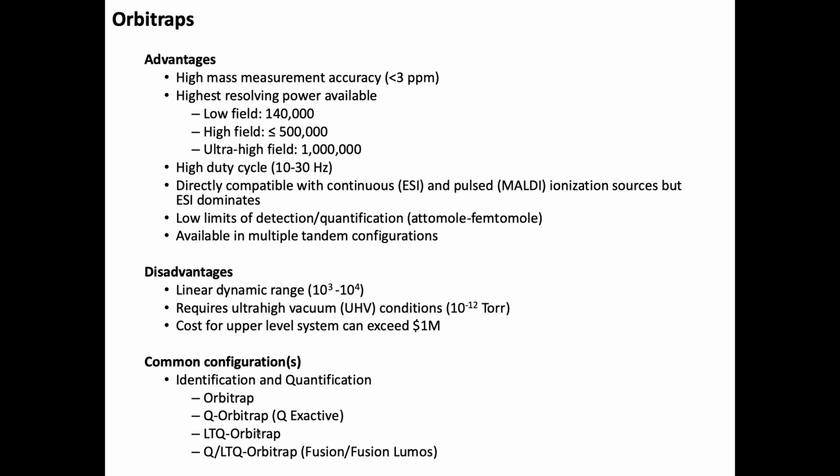But the tighter you can restrict the mass, the higher the degree of confidence you can give that this is the mass to charge, i.e. the molecular weight of your protein or your carbohydrate, plus or minus some mass accuracy. The more confident you can be that it's this or only a few other possible things. The bigger that window, so the poorer your mass accuracy, the more things can fit in that mass to charge space, right? And so mass accuracy really helps you deal with that.